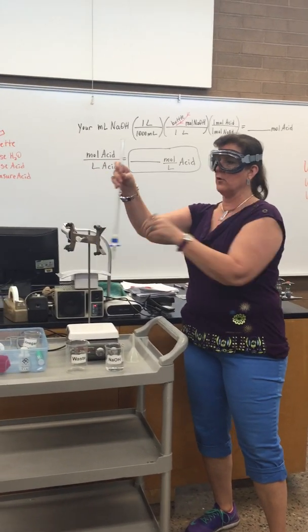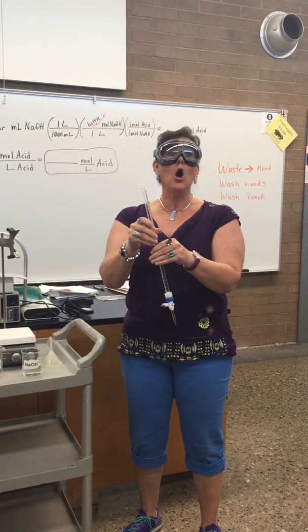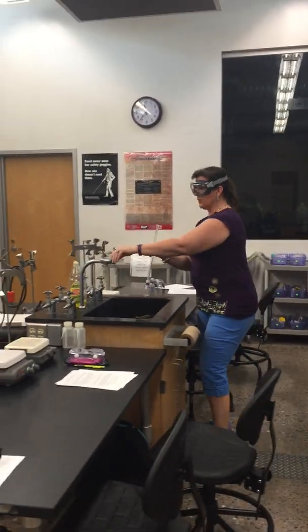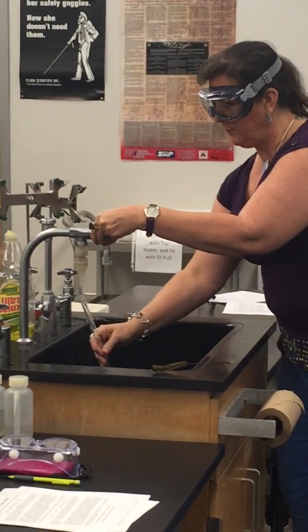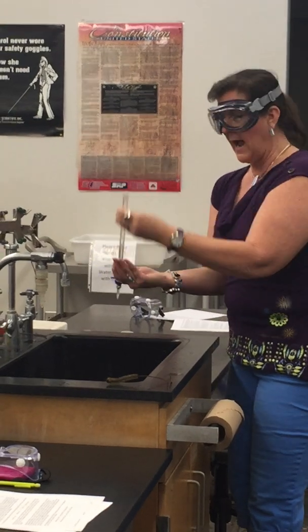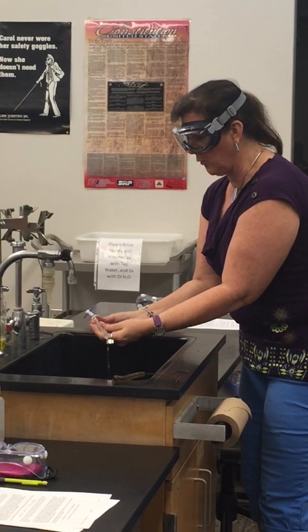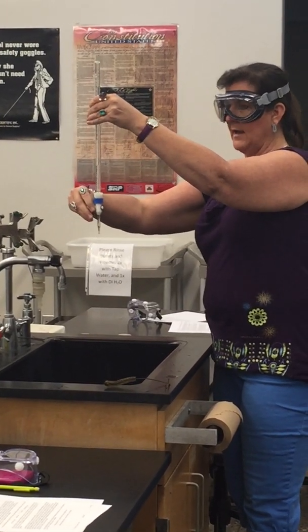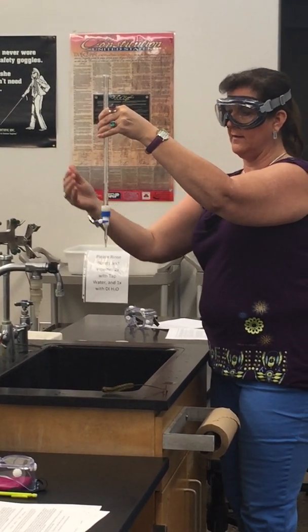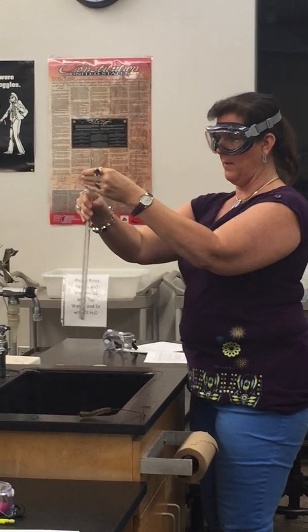You're going to go get a burette. We don't know what's been in this burette, so we need to rinse it with distilled water. Turn on the black knob, put a little bit of distilled water in the burette — you don't need to fill it all the way up. Turn it sideways and roll it around to let the inside coat with the water. Open it up and let it come out through the tip. When it's vertical, it's open; when it's sideways, it's closed. Then turn it upside down and let the rest of the water come out.